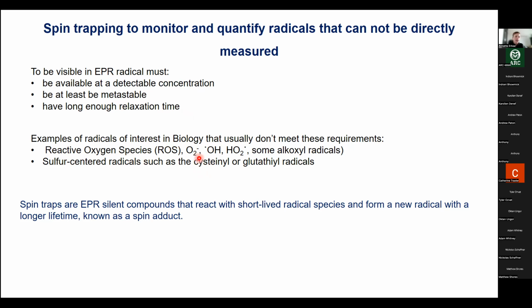The problem with them is that they are actually usually not there in high concentrations. At least that's what we hope. They are not very stable, have very fast relaxation times. So even if they are there in higher concentrations, we still can't see them on a normal EPR timescale for a continuous wave EPR at room temperature so that we are close to biological conditions.